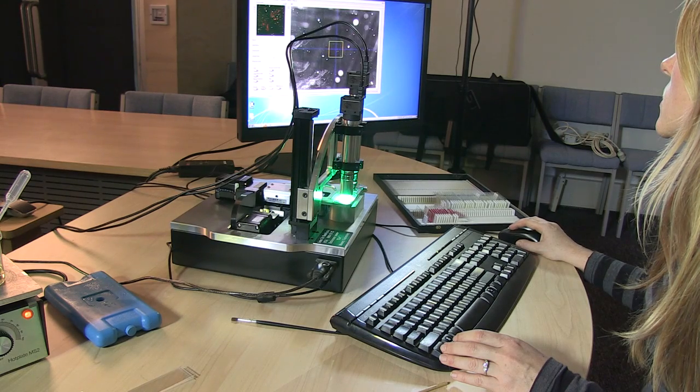Hi, I'm Dr. Kat Holt from Massey University working with Veritaxa, the inventor of the ClassiFinder Automated Pollen Counting System, which I'm going to demonstrate for you now.